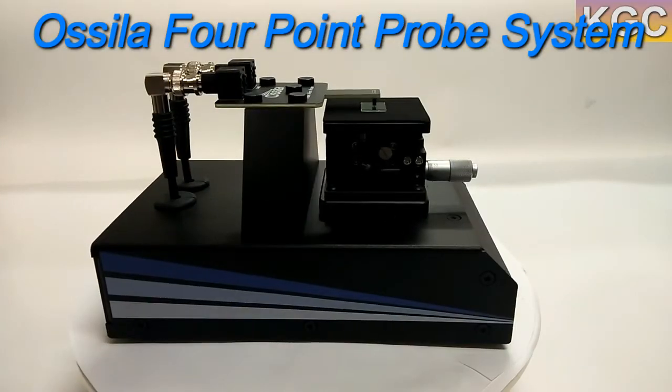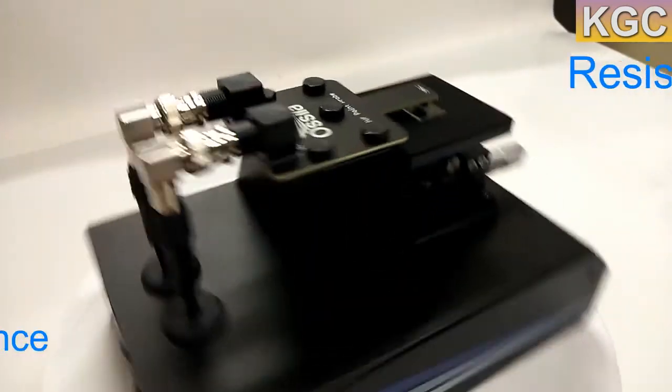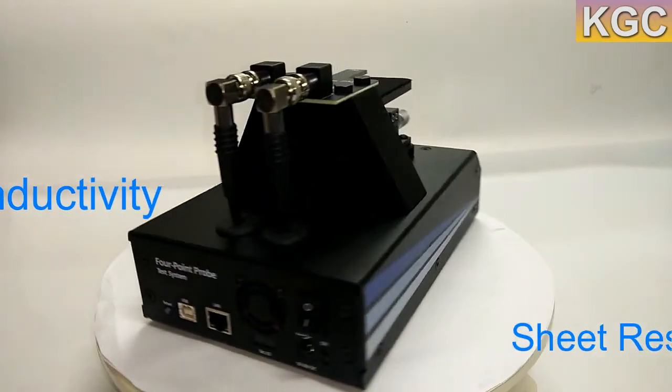In order to avoid this, meet the Ossila 4-point probe system, an easy-to-use tool for the rapid measurement of sheet resistance, resistivity, and conductivity of materials.